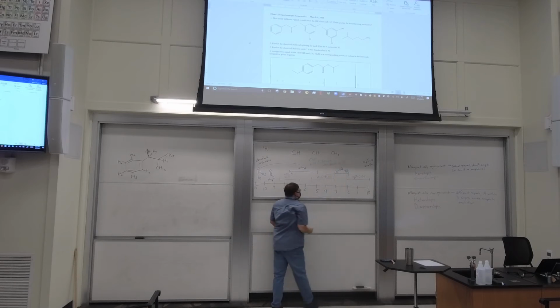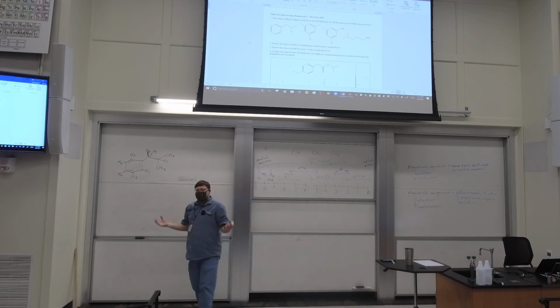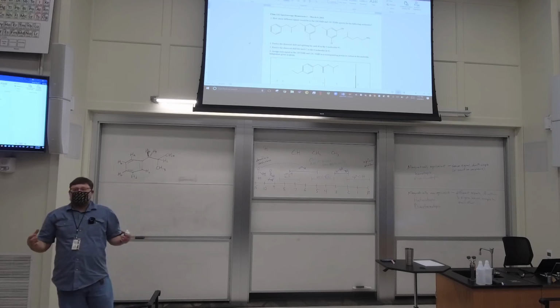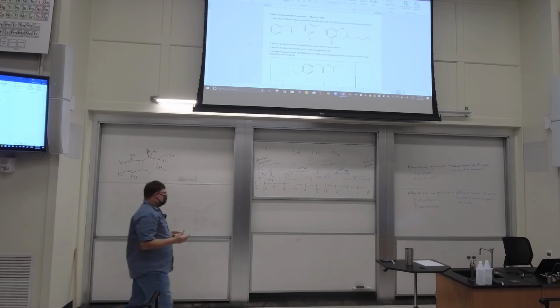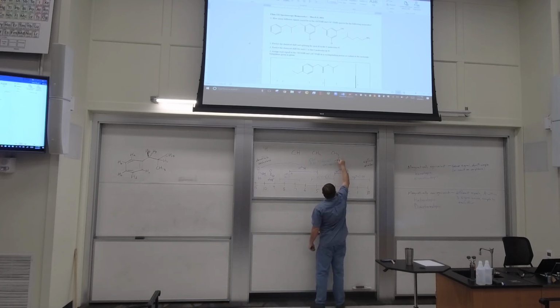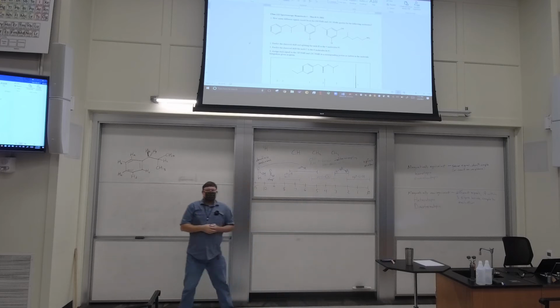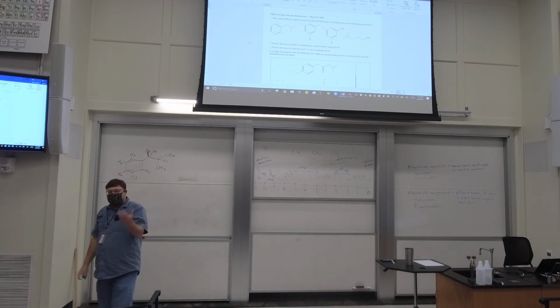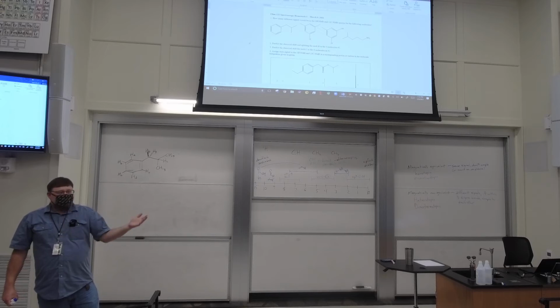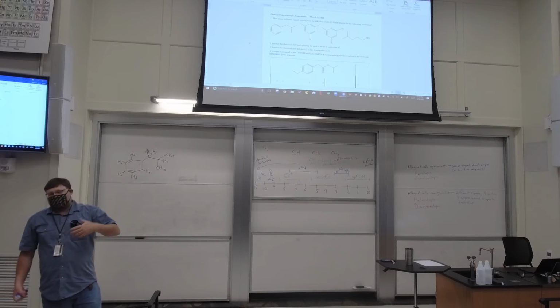All right, so OHs and NHs tend to have a very variable chemical shift, and they tend to be quite broad signals. Often you don't see coupling to NHs or OHs. OHs and NHs are basically pretty unreliable. You need to see the signal for them, right? If my molecule has an OH, that H has to show up in the proton NMR. But it can come almost anywhere. It could be broad. It could couple. It could not couple. It's hard to say.